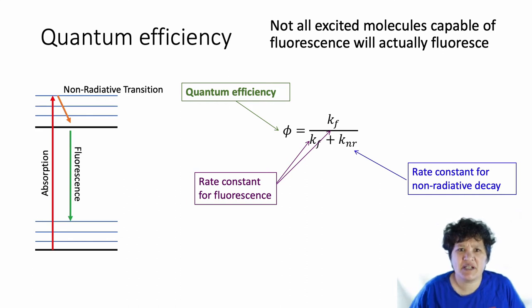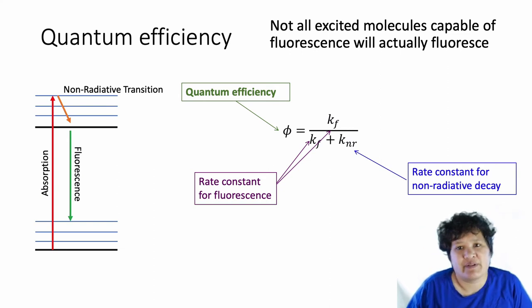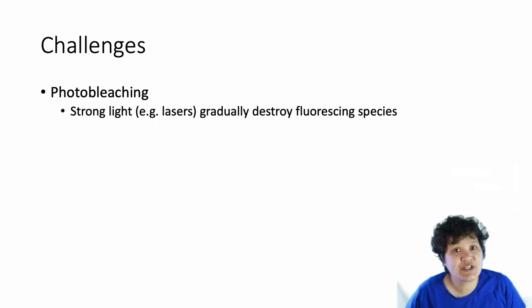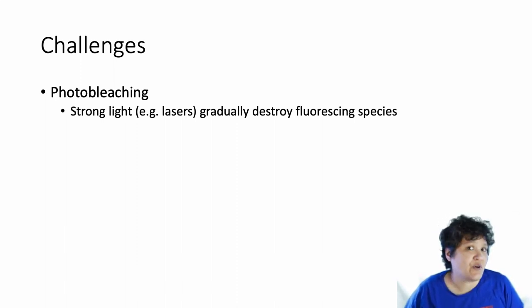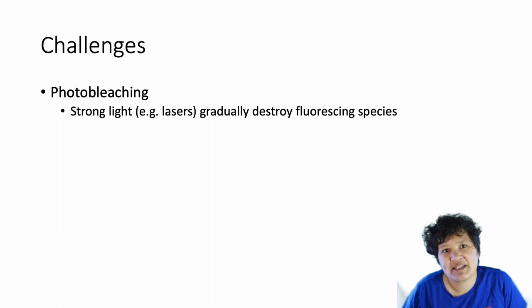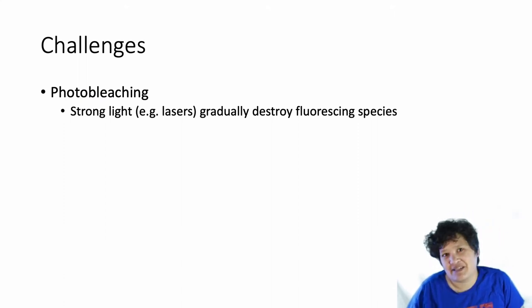There are issues with fluorescent spectrometry. The first is photobleaching — fluorescent molecules tend to be very sensitive to light, so as you expose them to light, those fluorescent species are going to be destroyed. You can't just keep your sample in the dark, because the actual act of measuring fluorescence is putting light through your sample. So the longer you measure, the lower your quantum efficiency is going to be. Photobleaching basically means your yields over time are going to go down.